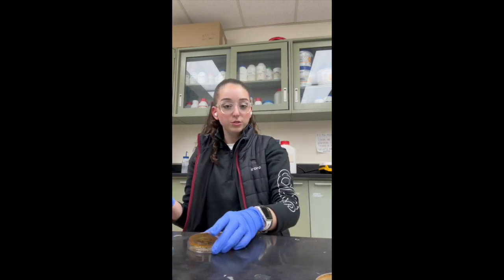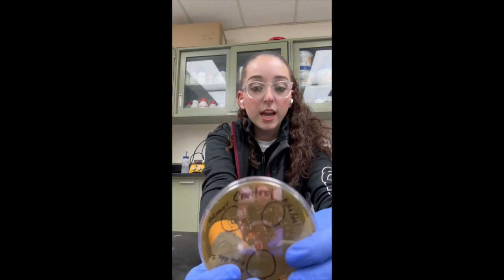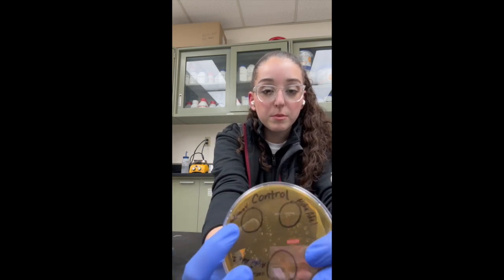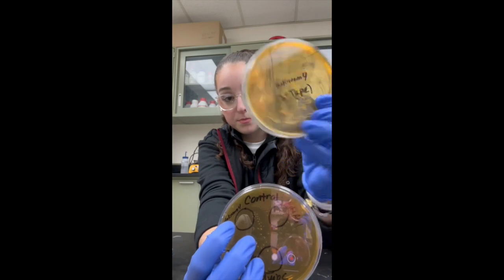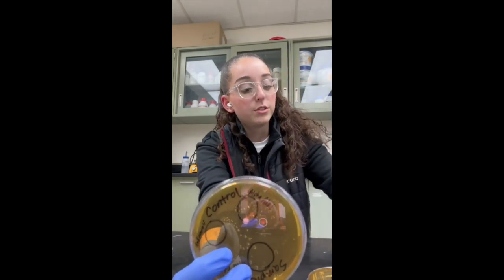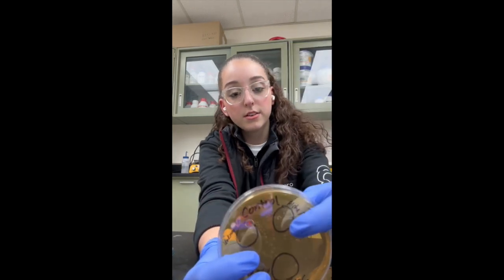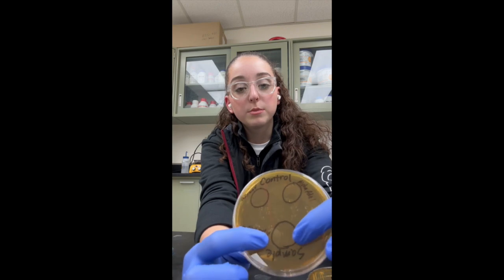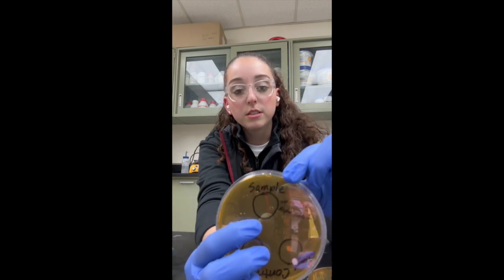So today we'll be plating yeast. I've already set up my plate. This is a YPD plate, and I have my control. I'm going to use unknown for A type and put that here, then use alpha ADE1 and put that here, and then I'm going to mix the two for my sample. Here I have it clearly labeled.